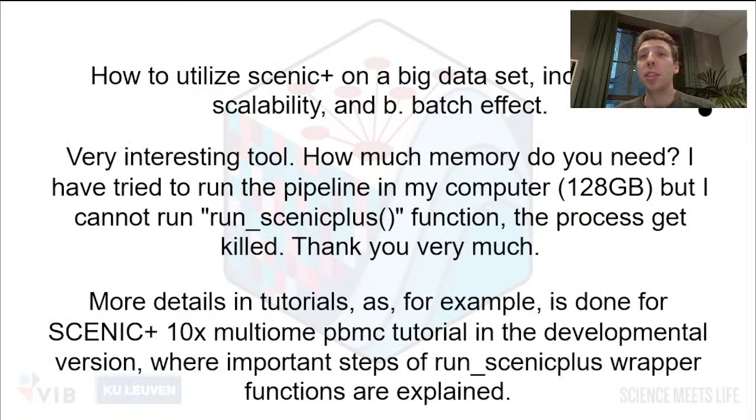Then a bunch of questions on scalability. So like I was showing now in the tutorial, we were showing the development branch. This is a lot more scalable, so it's using a lot less memory. So I would really suggest to use the development version of SCENIC Plus, which will, by the way, become the default version quite soon. So you better already get used to it if you are starting your analysis now.